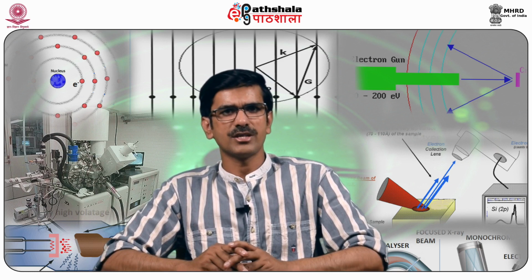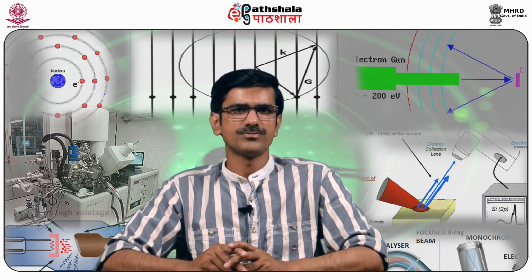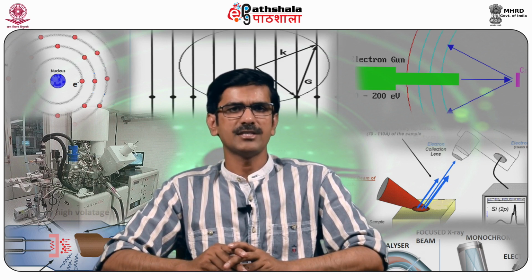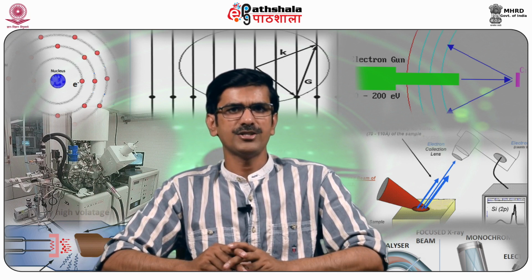The gas to be studied is leaked into the source volume. For a typical slit size of 1 cm by 0.2 mm, a differential pressure of 10⁻³ can be maintained if the spectrometer is being pumped at the speed of 100 liters per second.